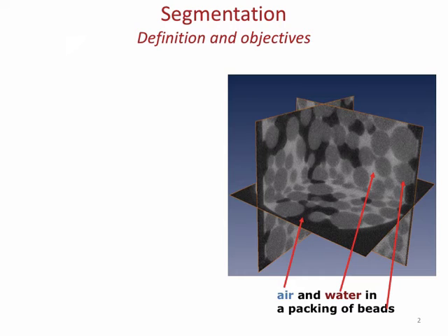And then based on that assumption, it will compute, and based on the amount of gas that went into the sample, it's going to figure out how much surface I have. Okay? So there is some underlying model that is assumed. So I might get numbers that are very different from whatever I might measure from images, because with images, I'm stuck on a particular length scale.